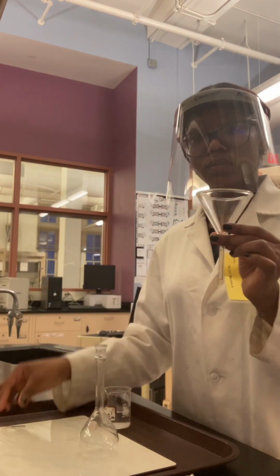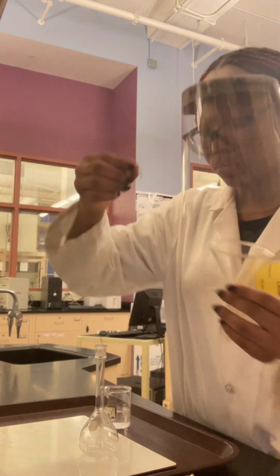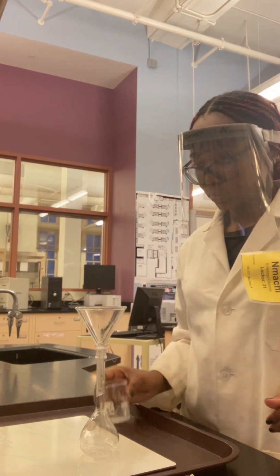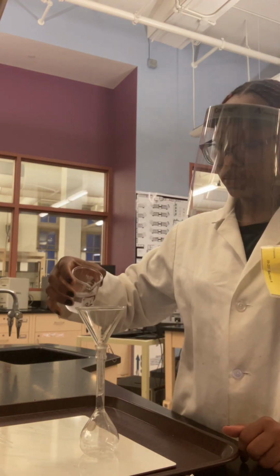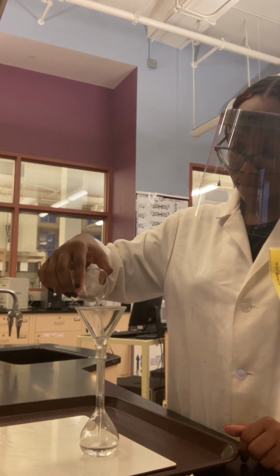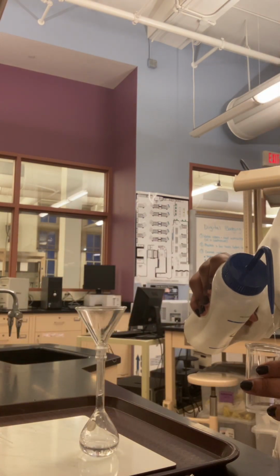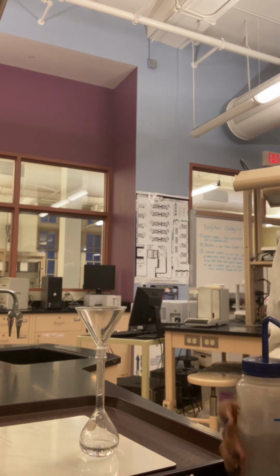So to pour the solution into the flask, I'll be using a funnel and I will also be using a paper clip to prevent air bubbles from forming at the top between the funnel and the flask. So after pouring out the solution, I will then again rinse it out with my wash bottle and just pour more water into the volumetric flask.